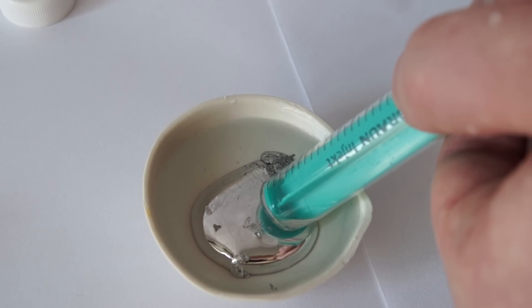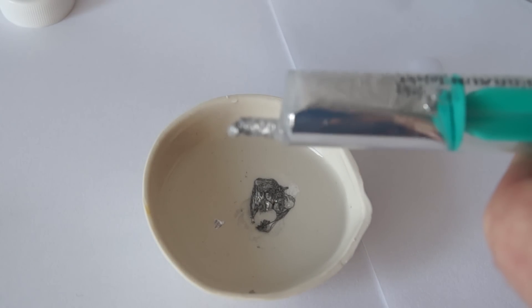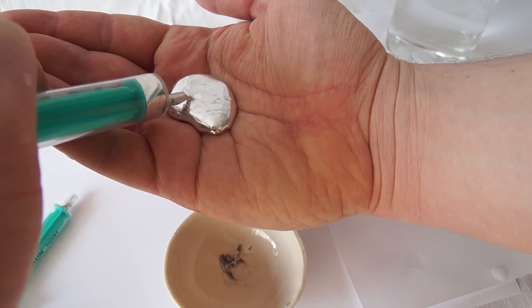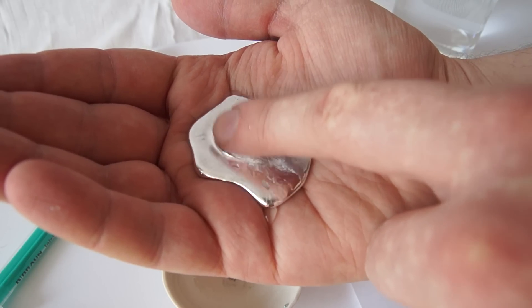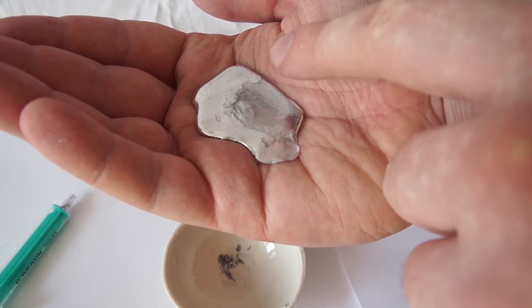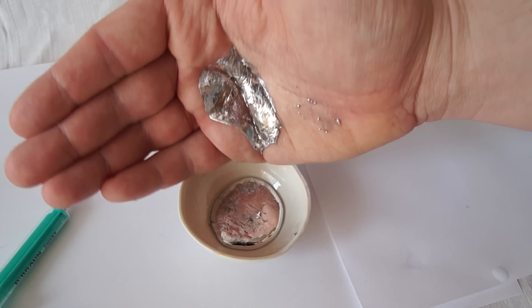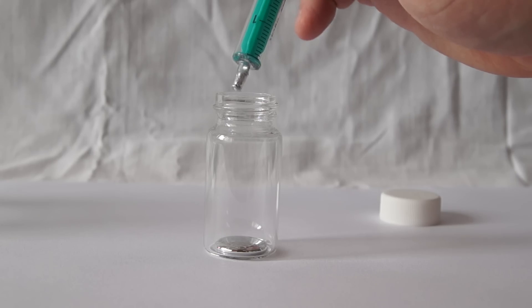Molten gallium can be poured into a syringe for easy transportation and carrying out experiments. I'm trying to release as much gallium as possible into my hand from the syringe. It's a very strange feeling when you hold liquid metal in your hand. And unlike mercury, gallium is not toxic. However, gallium does have one big disadvantage – it is very dirty, since gallium has a low surface tension and wets many surfaces.